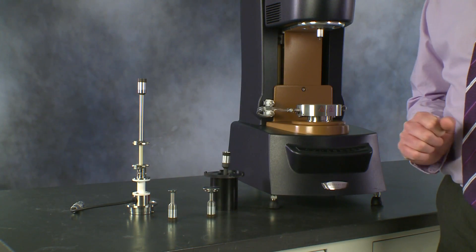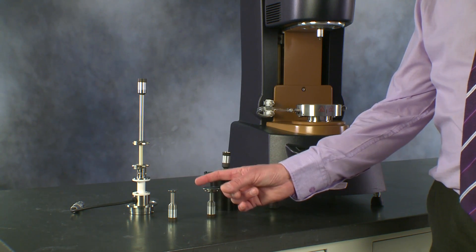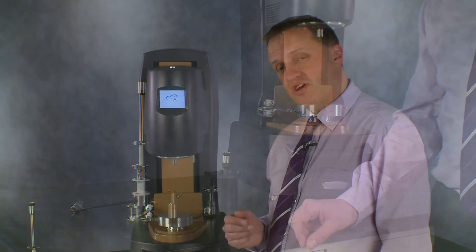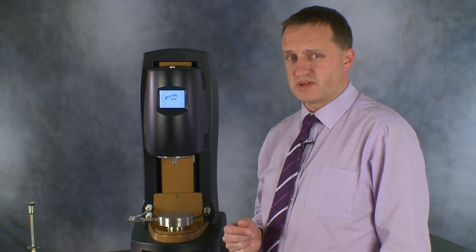There are many choices of geometries, some of them for dealing with very low viscosity fluids all the way through to stiff samples. We consider the right choice, the right material, and the right options for you to get the best of your measurements.